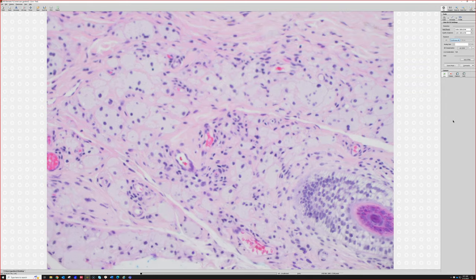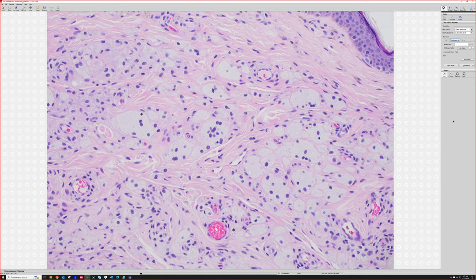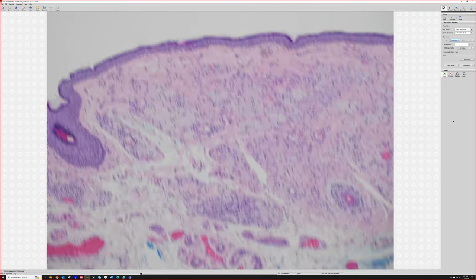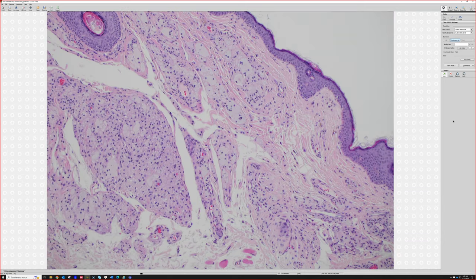And they usually just have a bunch of foamy histiocytes, sometimes multinucleated like here, filling up the dermis in either sheets or little clusters or nodules with very minimal inflammation. Okay, so we're not seeing much in the way of lymphocytes or Touton giant cells or granulomas. We're just seeing the foamy histiocytes. Oh, I lied. Look, there's a little granuloma there. But in any case, it tends to be mostly foam and very little of other cell types, which is how you can help sort it out from other things like xanthogranuloma or other processes.